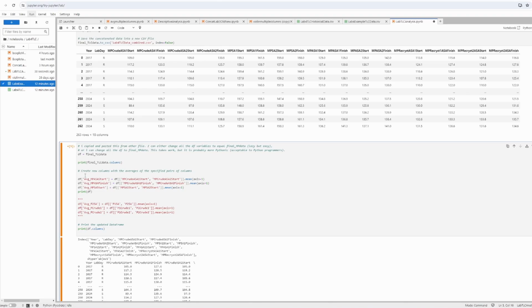What we're looking to do, the next step after concatenating the data, is to average them out. With the melting point example, we have a melting point for 1 and 2, but in this case we're looking to average out the crude ASA for plate 1 and the crude ASA for plate 2, and give it a different name. So here I'm mixing in and modifying. The two are pretty much like TLC and melting point data, but we'll try to get this squared away.